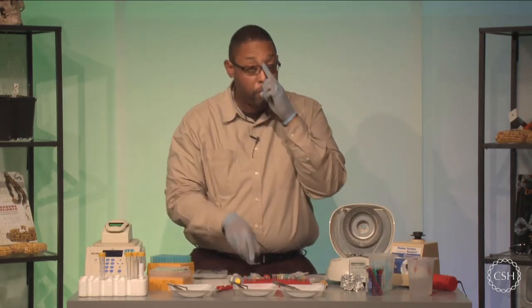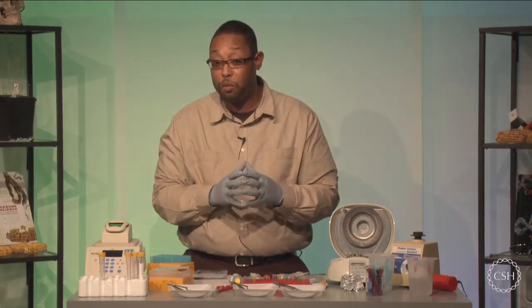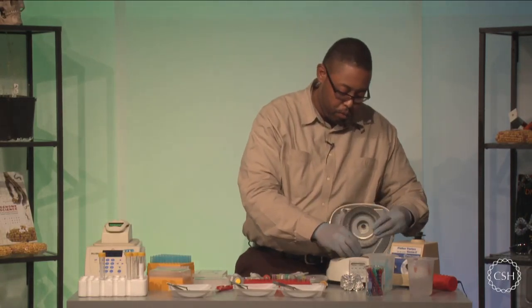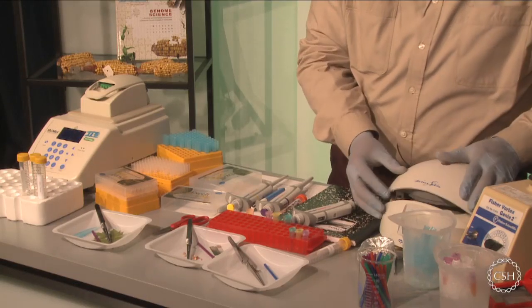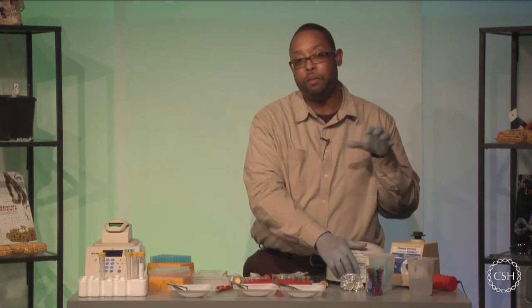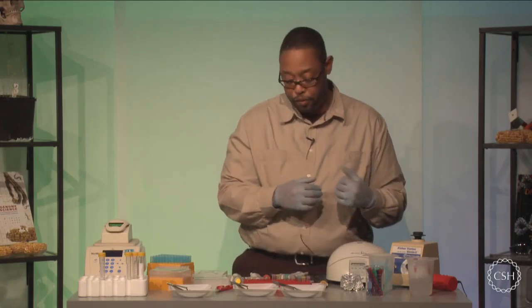Okay. Now, one of the things I mentioned is that we have to make sure we get all the alcohol or all the wash buffer physically off, because we want to elute the DNA next. So what I'm going to do is place these back into the centrifuge one additional time, and give them a brief spin. This brief spin is going to allow me to get the remaining portion of liquid back to the bottom of the test tube so that I can remove that material.